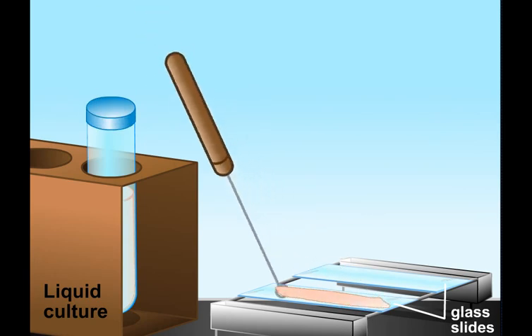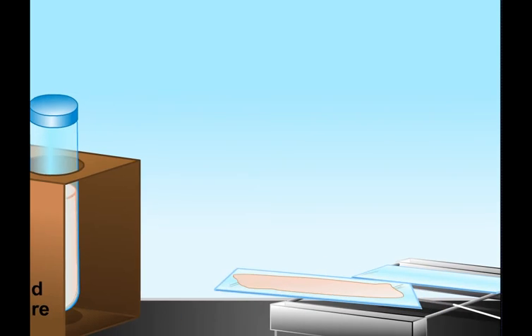and allowed to dry. If the cells are on an agar plate, they should first be transferred to a liquid medium for dilution. The cells should form a thin, barely visible film. This can be achieved by smearing cells obtained from the surface of an agar medium or from a liquid culture. Fresh cultures must be used because as cells age, they lose their ability to retain the stain.